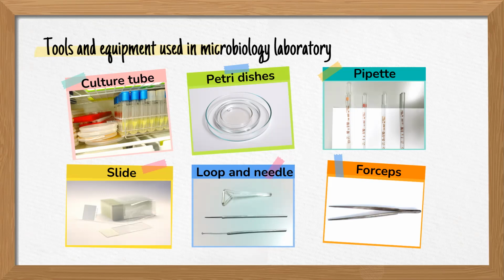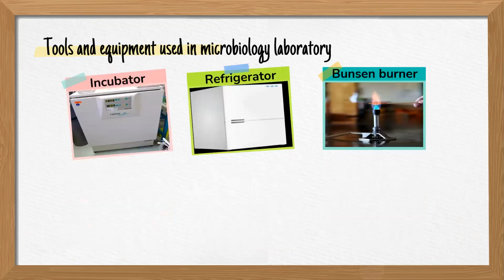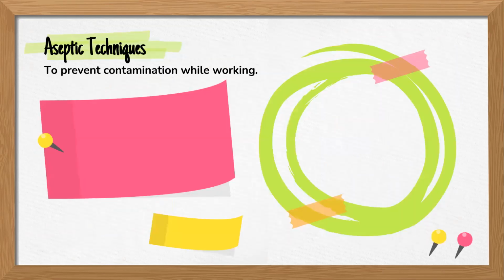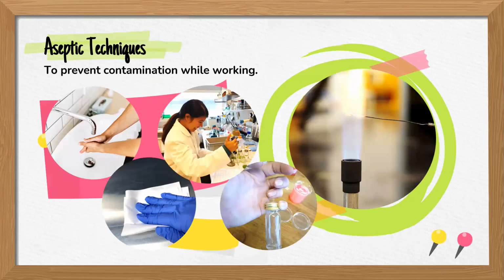The tools that I would like you to write down the characteristics and the picture of are: inoculating loop, needle, Bunsen burner, petri dish, culture tubes, pipettes, autoclave, and hot air oven. Then move on to the next experiment.